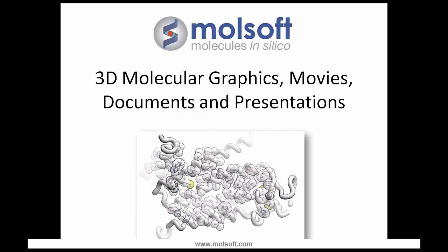Welcome to this webinar on 3D molecular graphics, movies, documents and presentations. The majority of this demonstration will be based on our free software that you can download from our website called ICM Browser.